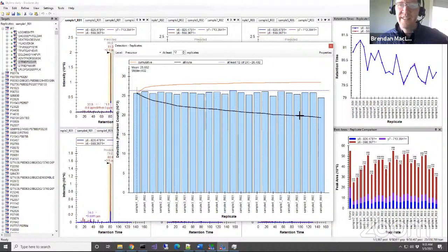And then here, this drop off is what was actually visible in all runs. And as we add runs, that goes down. But still, over 20,000 things we have a peak detection of, in every single one of those across all 24 runs. So that's pretty good. That's getting back to that heat map that we showed about missing values. The missing values here are pretty nice, and not that many of them.